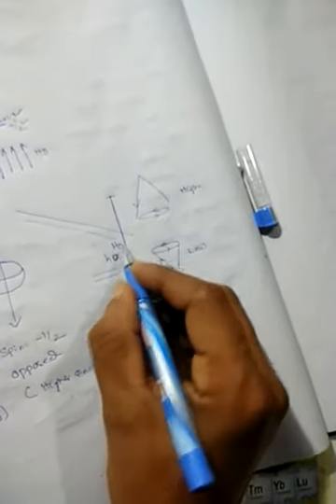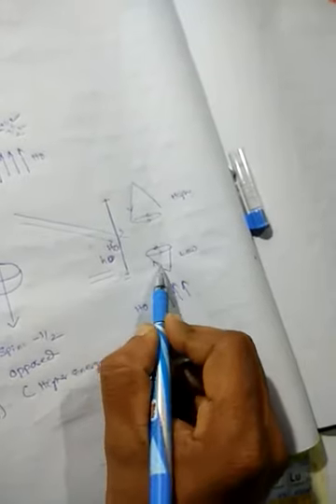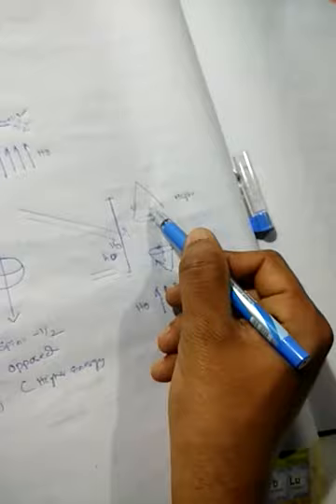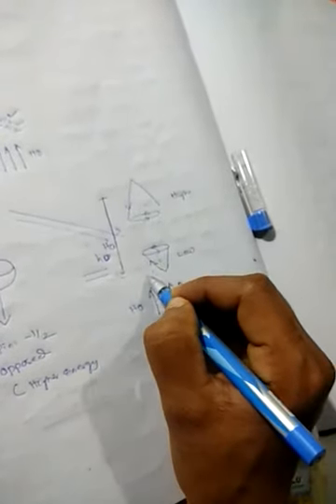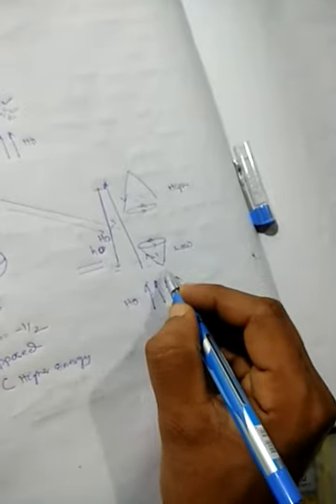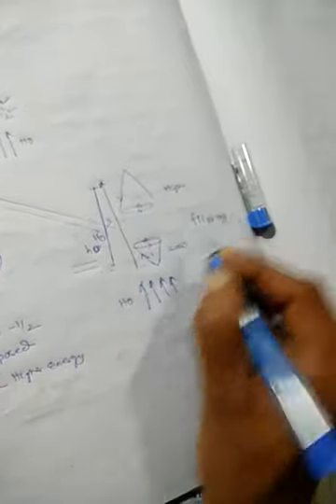By absorbing a certain amount of energy, the nucleus can go from the aligned to the opposed orientation, or by losing energy it comes from the opposed orientation back to the aligned orientation. This type of shifting from aligned to opposed or opposed to aligned orientation is known as flipping.